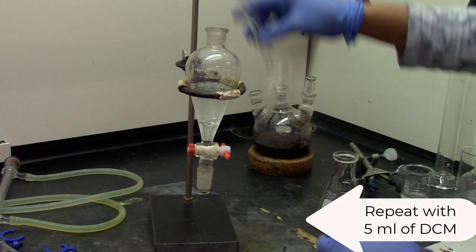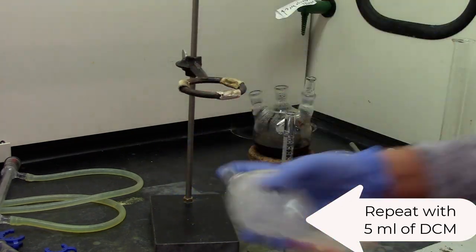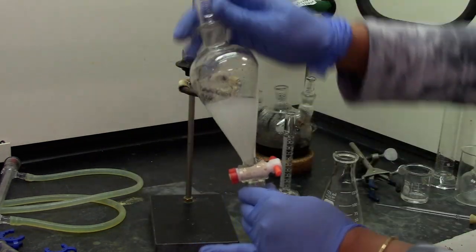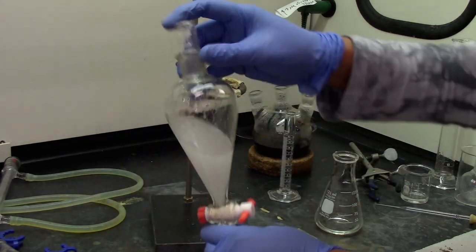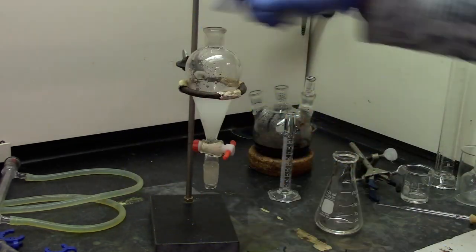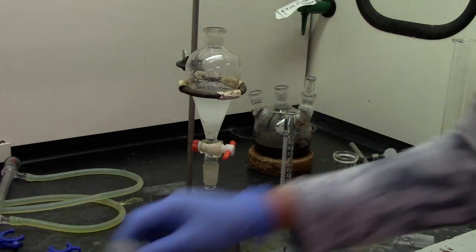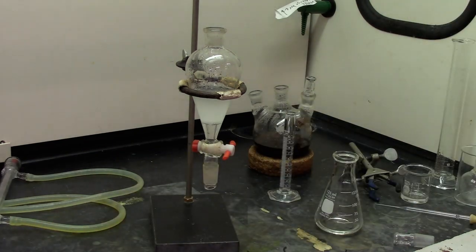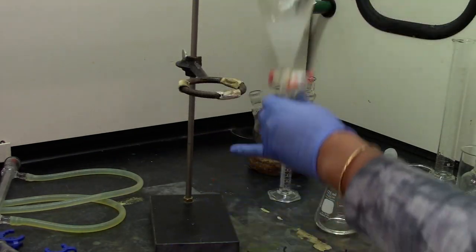Add 5 ml of dichloromethane or DCM, give it a good mix, vent and let the two layers separate. Once separate, collect the bottom layer into the same unmeted flask. Repeat it a third time with 5 ml of dichloromethane.